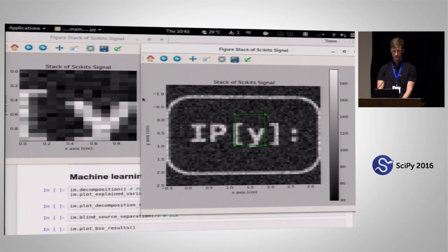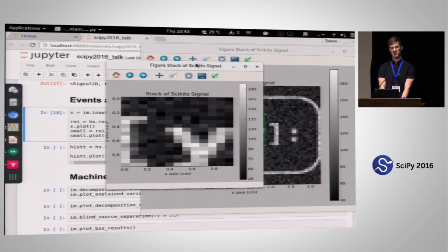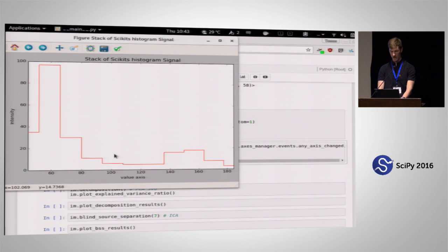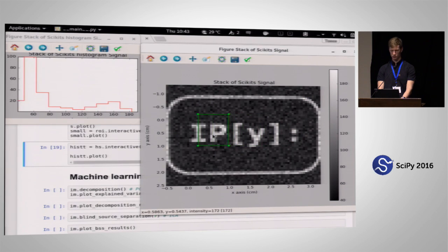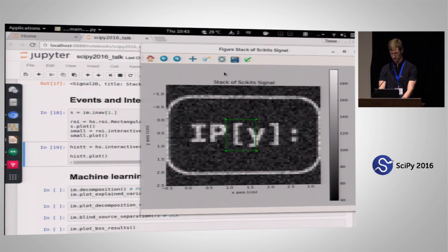It works fine. Actually, this figure that I have right here in the middle is just a signal that has its data updated as required. So we can do other stuff before plotting. For example, we can calculate a histogram, and that will be updated live as well. I'll just resize it again as I move it around, and so that's just updated. That's very useful as well when dealing with real physical data. You can also notice that the number of bins in the histogram is recomputed. It's not constant, so that's because we used some fancy histogramming tool from AstroML, I think.